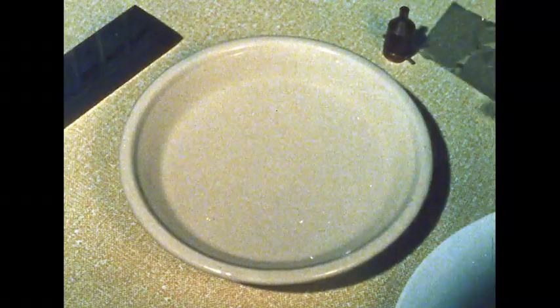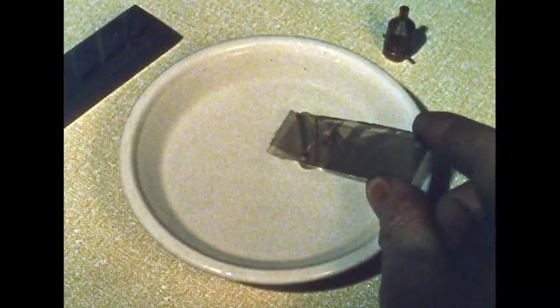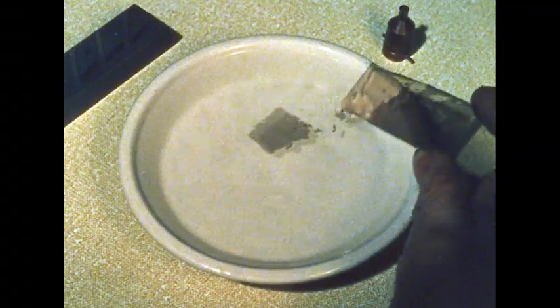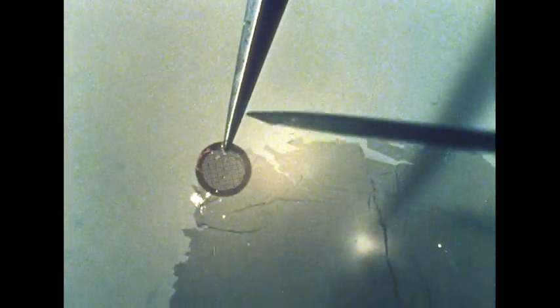If a heavy current is passed through 2 carbon electrodes in a vacuum, carbon will condense on a slide beneath. The carbon forms a sheet 20/1,000,000ths of a millimeter thick, which can be floated off. It is thin enough to be easily penetrated by a beam of electrons, so it can act as a support for specimens many times smaller than the holes in the grid.